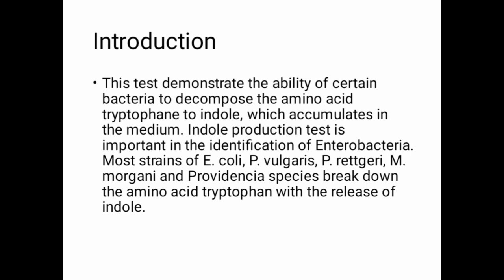This test basically demonstrates the ability of certain bacteria to decompose the amino acid tryptophan to indole. So there are certain bacteria that decompose the amino acid molecule tryptophan to indole. So what is indole? Indole is basically the end product of the amino acid tryptophan.